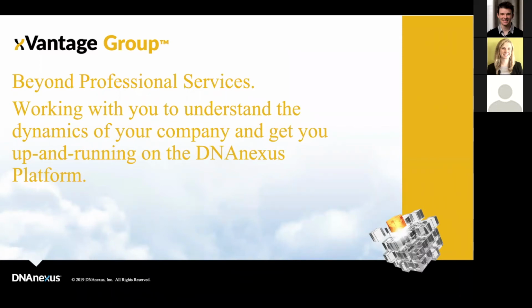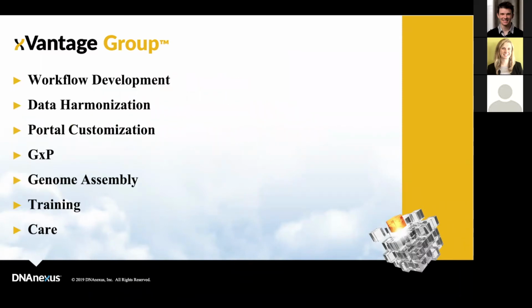Some of the services that we provide as part of the Xvantage group are customized workflow development and workflow portability. So if you would like to run some of your on-prem workflows on DNAnexus, the DNAnexus Xvantage group and our bioinformaticians on staff would be able to help you deploy those workflows in a more scalable environment such as DNAnexus. We also provide data harmonization services in which we can harmonize your own data types onto the platform.